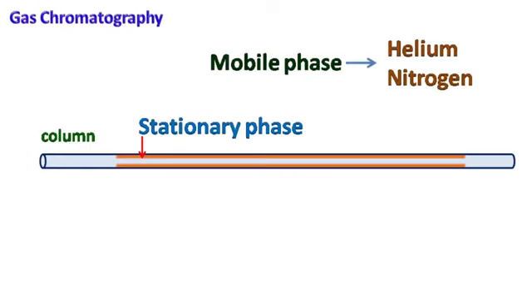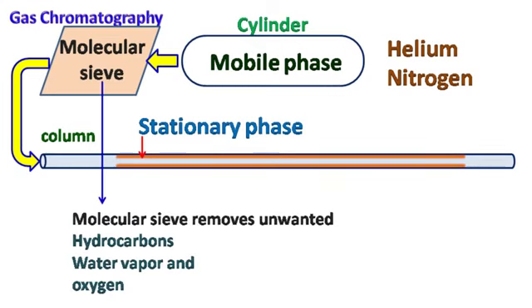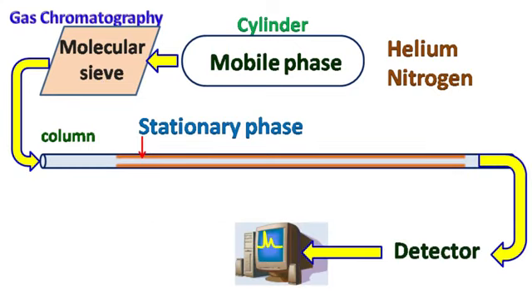The mobile phase. The mobile phase used is usually an inert gas like helium or an unreactive gas such as nitrogen. The mobile phase gas is kept in a cylinder which is connected with the column via a molecular sieve. The molecular sieve removes unwanted hydrocarbons, oxygen and water vapor that may interfere with the test sample during analysis. At the end of the column, there is a detector which detects the sample.